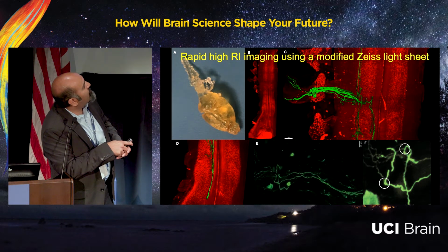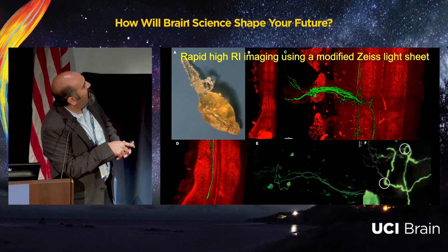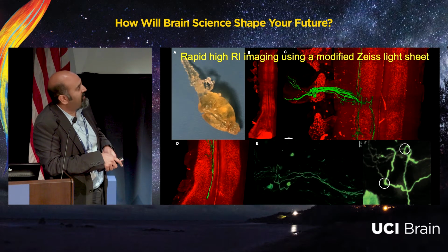Here's a zoom in that shows you where one of my students placed a viral injection in vivo to label some of these sensory neurons, which have a peripheral process that innervates, in this case, the forepaw, and then these central axons. My student had imaged, actually, in vivo, using multiphoton imaging, a segment of this, and then he was able to reconstruct the entire neuron using brain clearing from that very same sample. So this shows you that there's tremendous power in this technology to see in 3D structures that previously with thin section histology we would have had a great deal of challenge to look at.